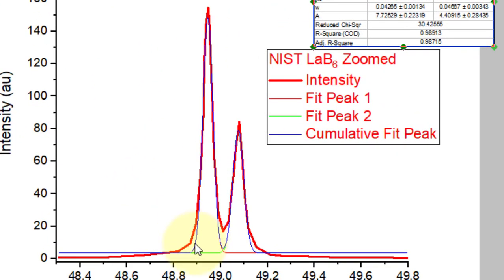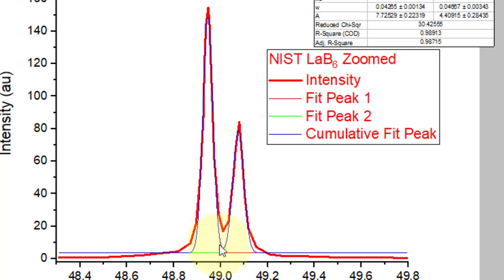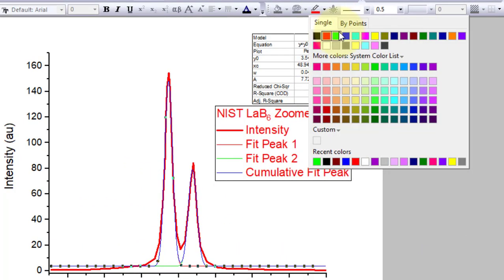First, check that both the peaks have been fitted well. Select the plots and ungroup. Now, change the size to see the overlapping peaks.